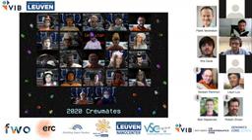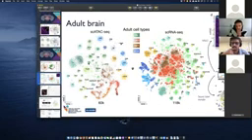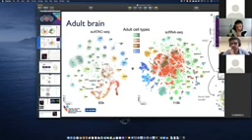I had a question, actually. I couldn't help noticing in your t-SNEs, you managed to get far better separation between your clusters using the ATAC-seq data than using the single-cell RNA-seq. And it did look like the cell types really clustered differently in the slides about halfway through your presentation. So I was thinking, how much does this data influence how you identify cell types in the fly atlas? Because obviously the big atlases mainly use single cell RNA data to differentiate cell types. Yeah, this is not so easy.